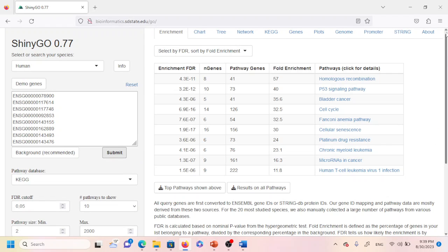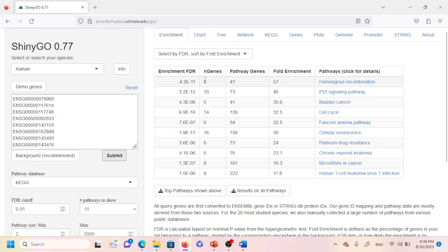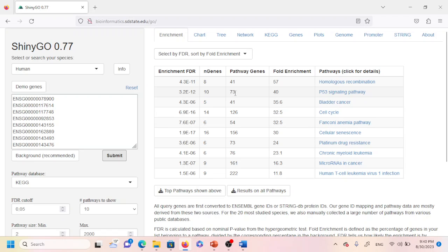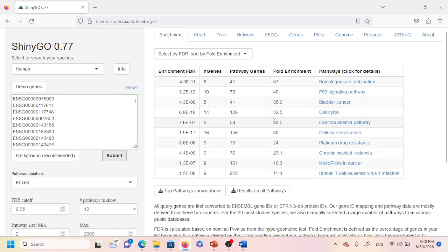After submitting, after some time you will see 10 pathways associated with the list of genes. Note that the KEGG pathway database is selected by default, but you can change it to compare with other databases. You can see pathway genes listed — for example, homologous recombination has 41, p53 signaling has 73, and so on. The fold enrichment for each pathway is also shown.